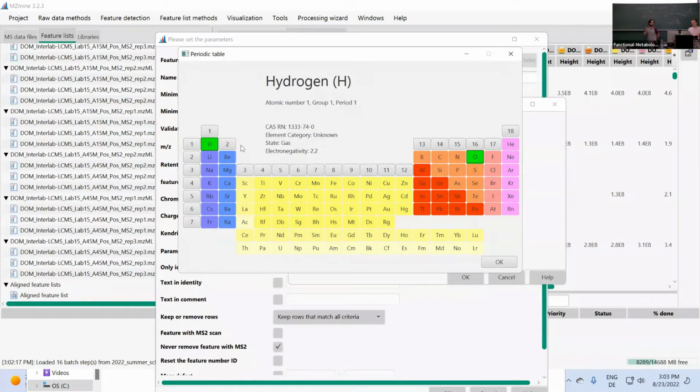We did this before, just on the feature level. Again, we can have some shifts due to overlapping signals in the MZ range, and we can also have weirdly distributed isotope patterns. So it makes sense to do multiple feature filtering steps.